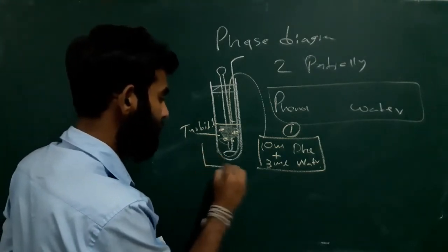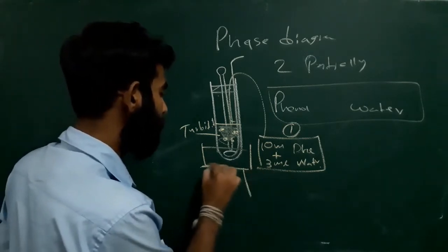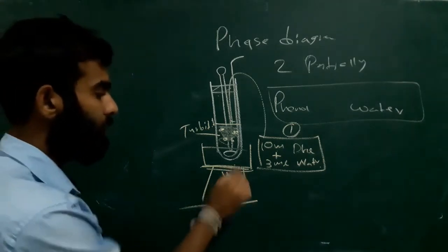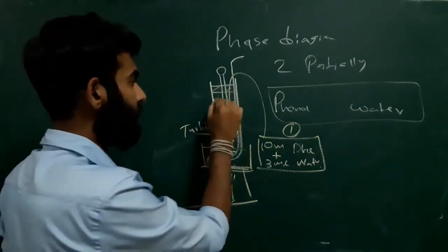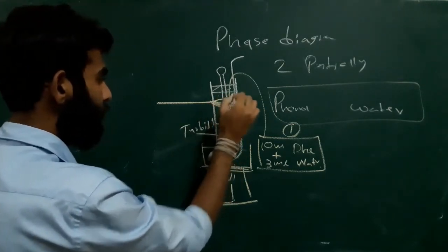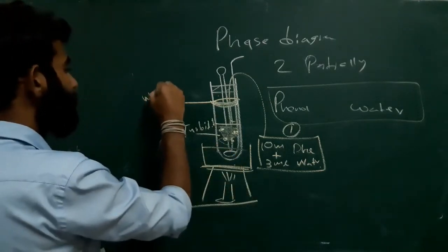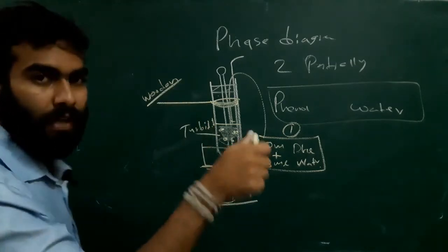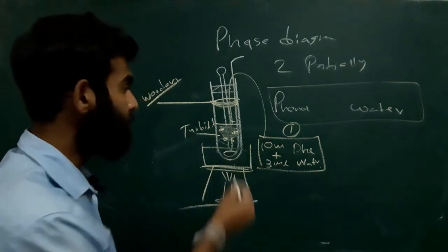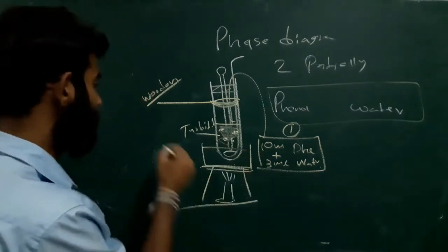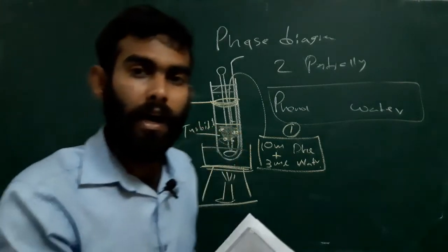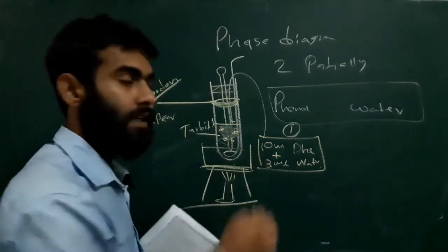We will use a water bath with a tripod and Bunsen flame, and we will heat this water bath. Consequently, this boiling tube will get heat. We will use a wooden boiling tube holder to handle the boiling tube. When we increase the temperature, at some higher temperature, this turbidity will disappear. That means at that temperature, the two solutions are fully miscible, and we can see a clear solution.